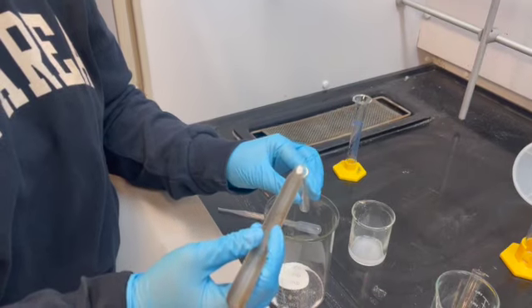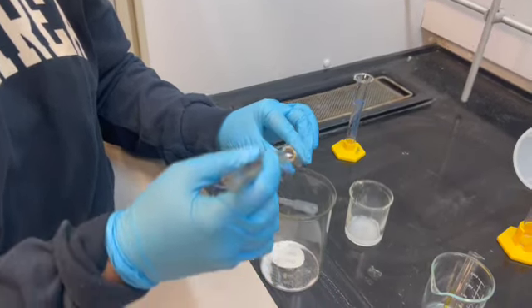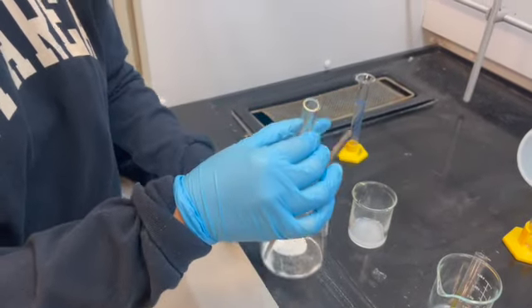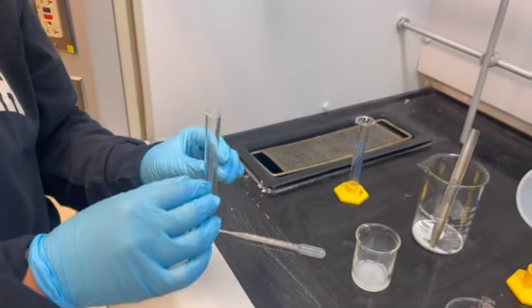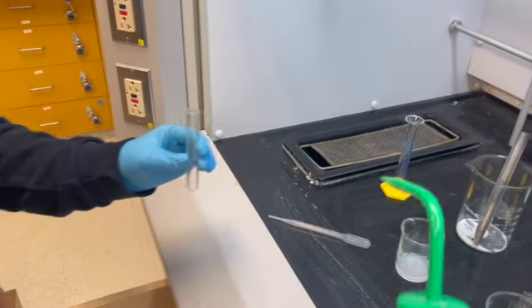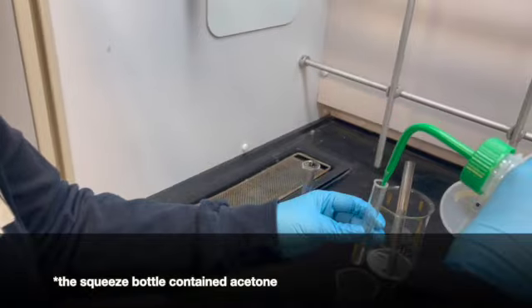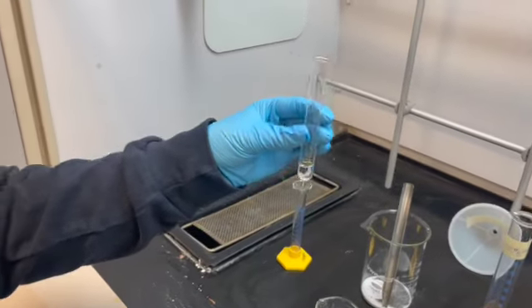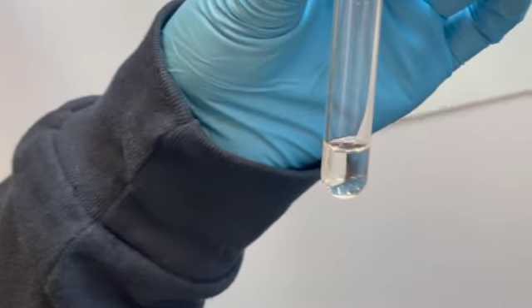Now we're going to be taking our solid into a test tube that we cleansed with acetone to dissolve it in more acetone so that we can get the IR reading. Here we have our solid dissolved in acetone.